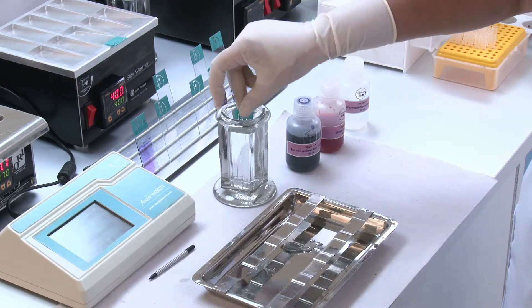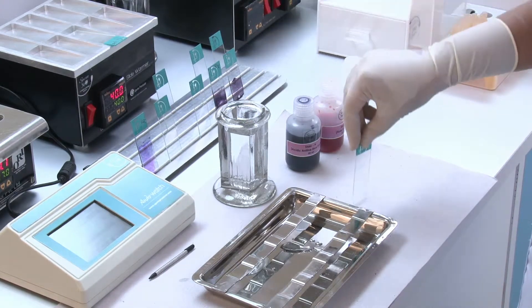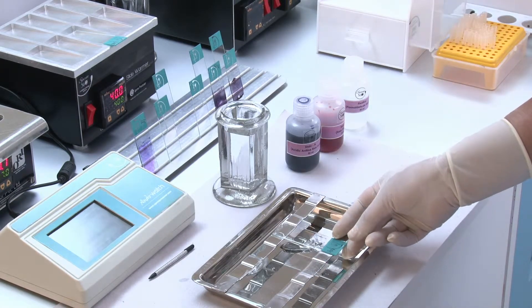Rinse the smear with distilled water. Drain off the distilled water. Keep the slide horizontally on the staining tray.